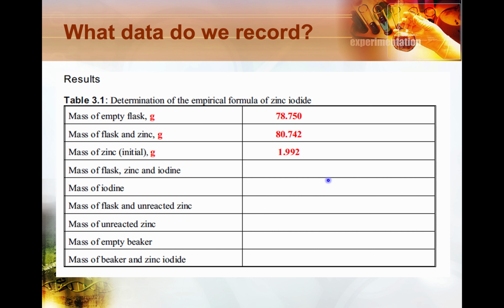As I said, we'll be providing tables for you for this experiment, and be sure to look at that table, and every time you see something you should write down, be sure to write it down with all the decimal points that the analytical balance gives you.